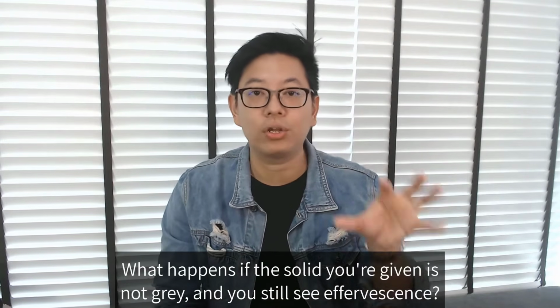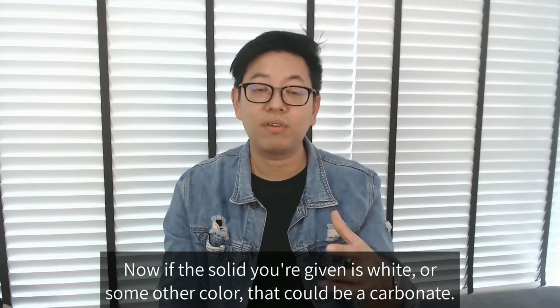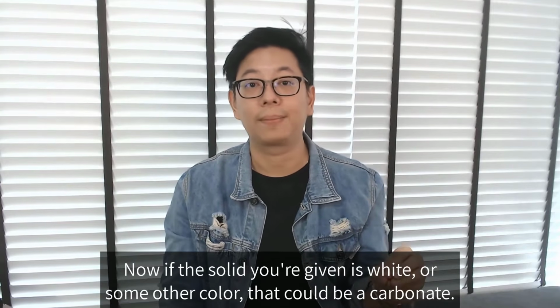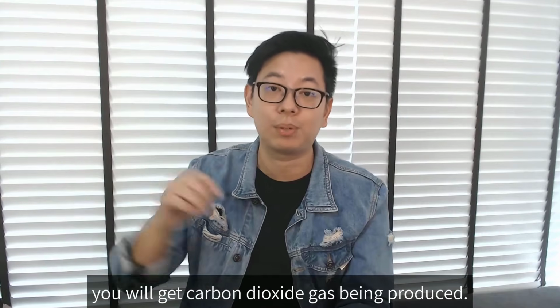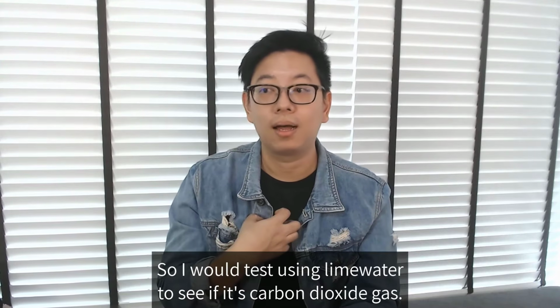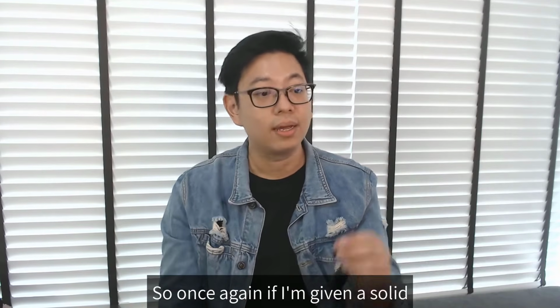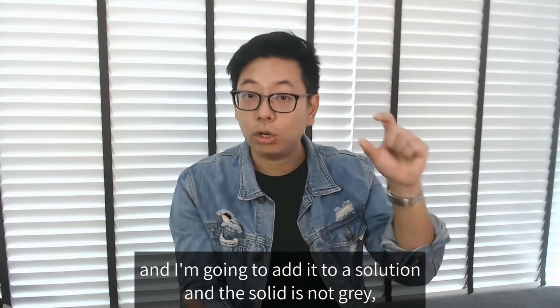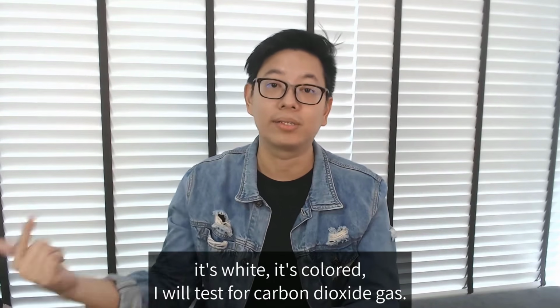Now what happens if the solid you're given is not grey, and you still see effervescence? Now if the solid you're given is white, or some other color, alright, that could be a carbonate. Alright, and when you add a carbonate to an acid, you will get carbon dioxide gas being produced. So I would test using lime water to see if it's carbon dioxide gas. So once again, if I'm given a solid and I'm going to add that to a solution, and the solid is not grey, it's white, it's coloured, I will test for carbon dioxide gas.